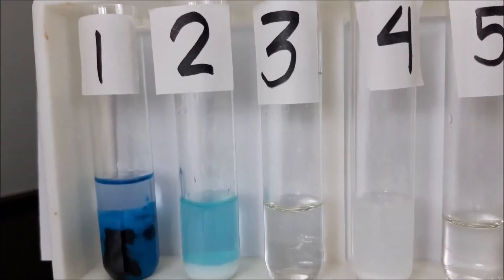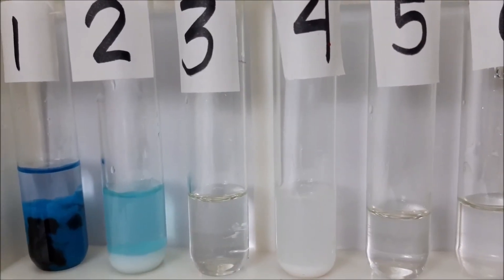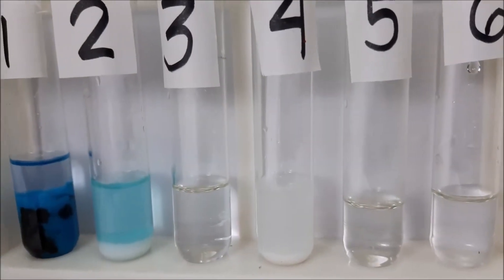Let's take a look at the summary of our experiment, starting with test tube number three.